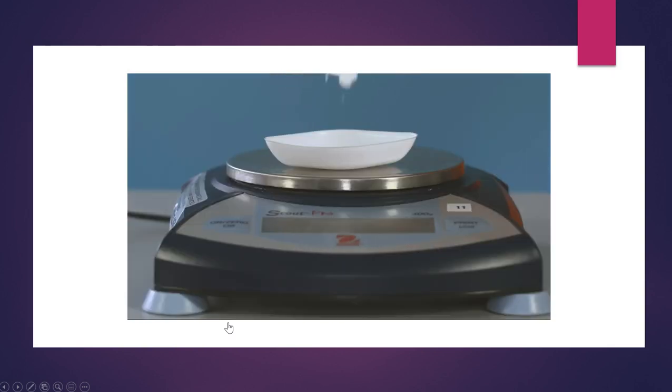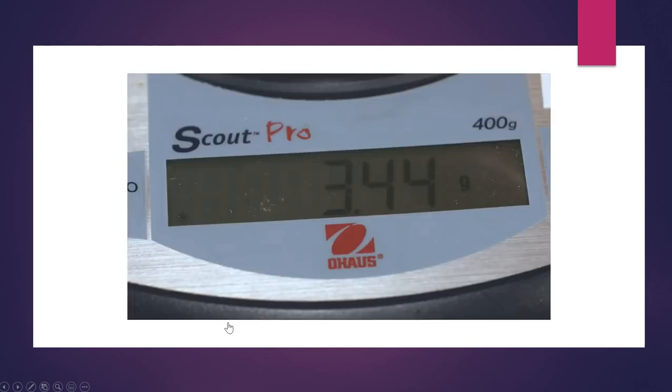To make up the standard solution, it's necessary to know accurately the exact mass of sodium carbonate, which will be dissolved in a known volume of water. The best way to do this is via a method called weighing by difference. Using a spatula, measure out approximately 2.6 grams of anhydrous sodium carbonate. Record the mass of the sodium carbonate with the weighing boat.